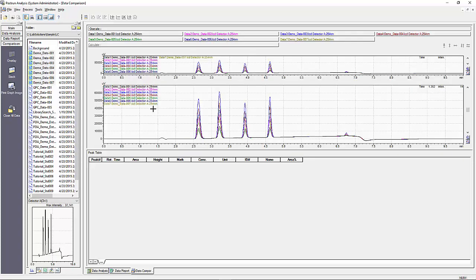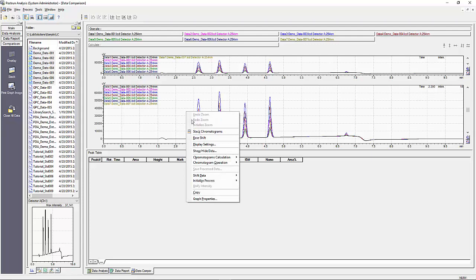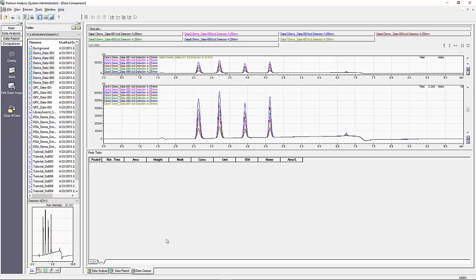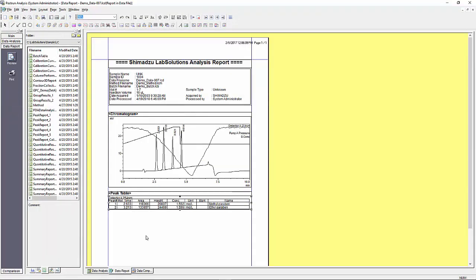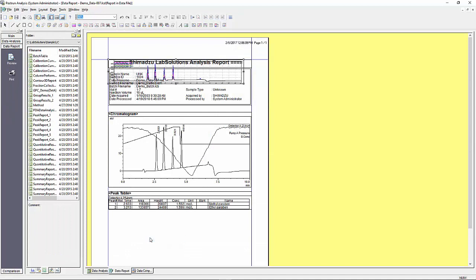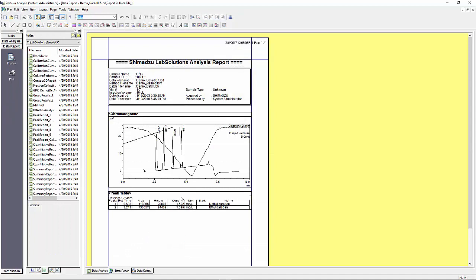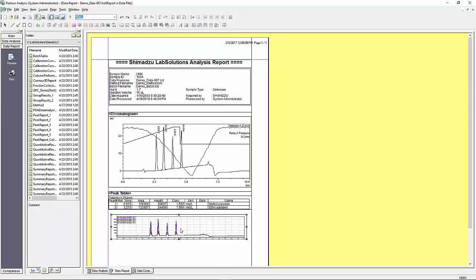One other convenient feature of LabSolutions reporting is the availability to copy and paste images from other LabSolutions views into your report. In this case I have a data comparison view that I want to include in this report, so all I need to do is from the data comparison copy the image and then once back in the report editor paste it, move it to where I want it, and then scale it accordingly.